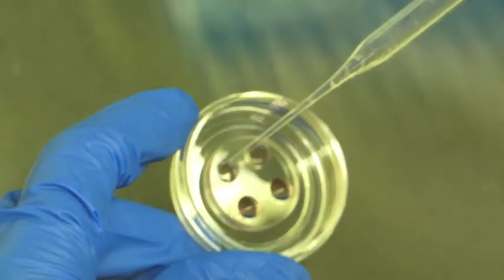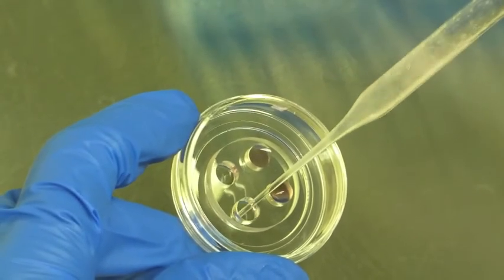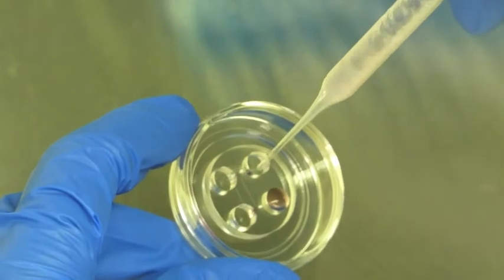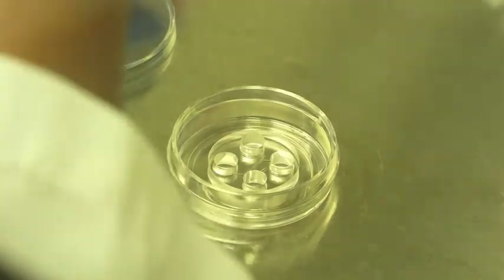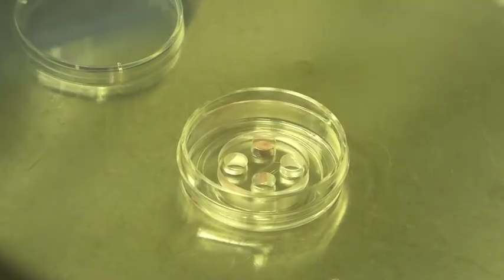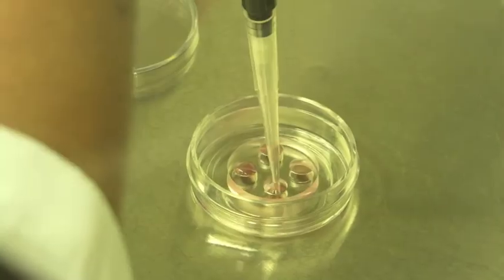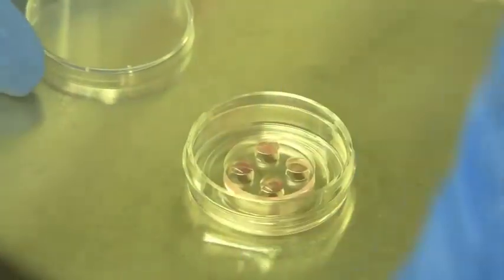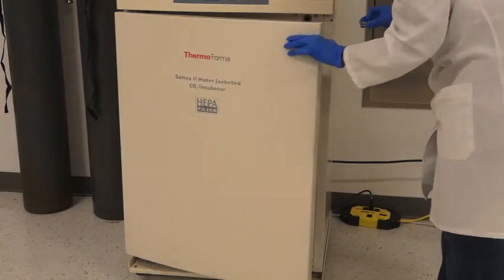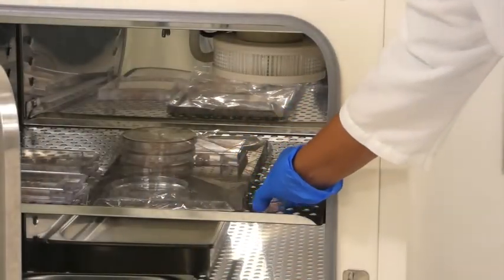After 24 hours, perform a media change by removing media from all the wells without disturbing the main channels. Immediately add 100 microliters of media to each of the top right and left wells. Allow the fresh media to enter the main channels and then fill the bottom wells. Cover the dish and culture the neurons within a 5% CO2, 37°C incubator for the desired number of days.